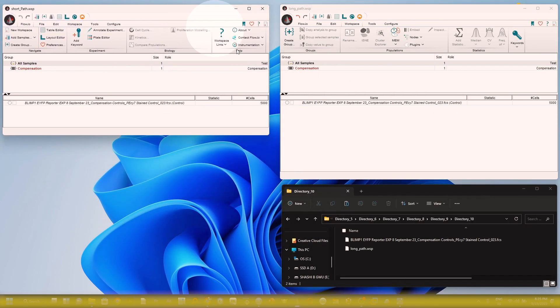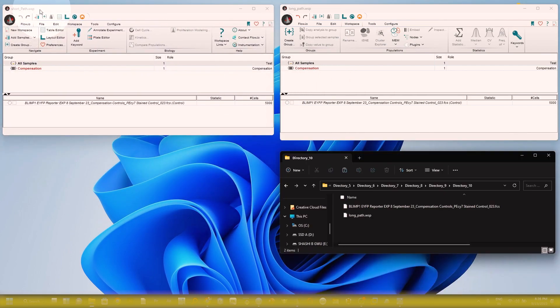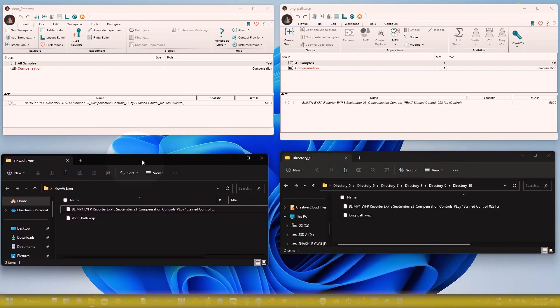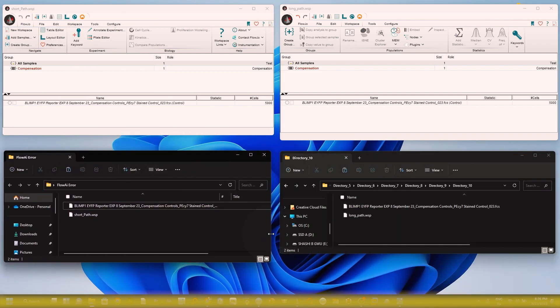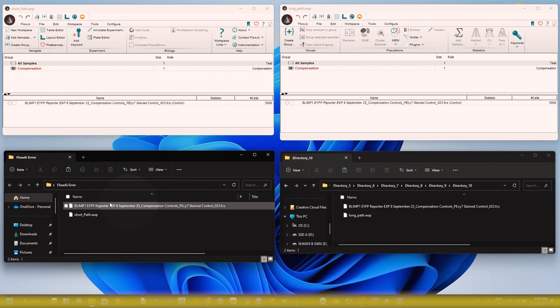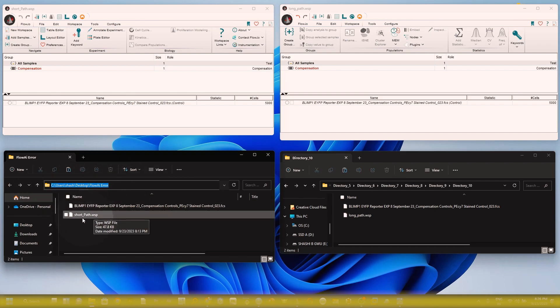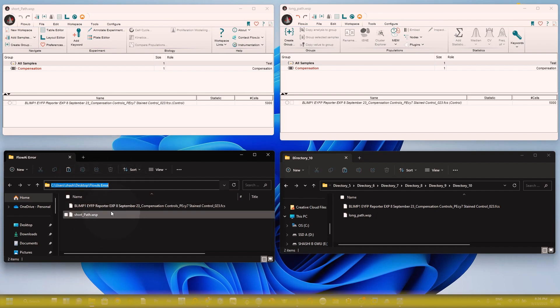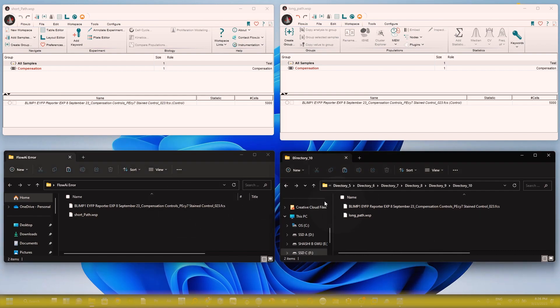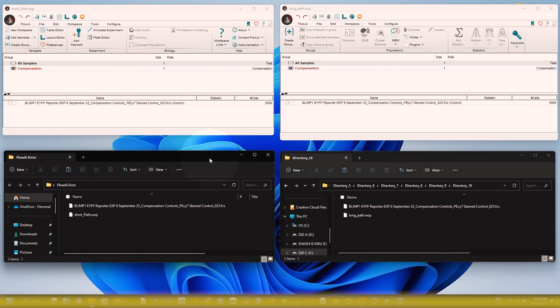The other WSP file I'm going to show you uses a short path. I used a short path to save the WSP file and the FCS file. You can see — I saved them on the Desktop in a folder called 'FlowAI Error Folder.' This short path is the key difference, and the long path is the major cause of the FlowAI error in FlowJo software.